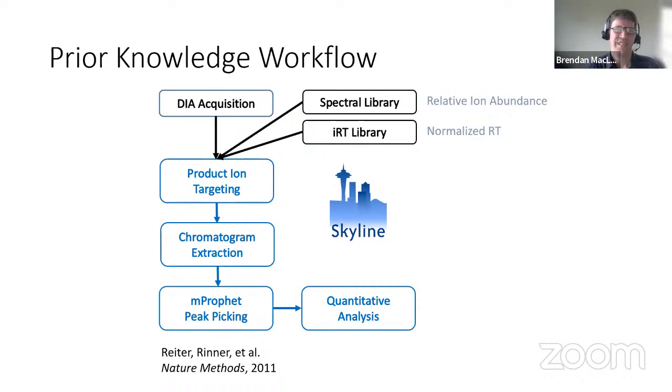Amazingly, a fairly normalized collision energy in Thermo is what PROSIT is trained on. I was able to use that to really impressively good effect on SCIEX TripleTOF data. You can go back and look at the PROSIT presentation I mentioned yesterday, that I gave at ASMS, and we actually even got better quantitative results in some cases using PROSIT predictions.